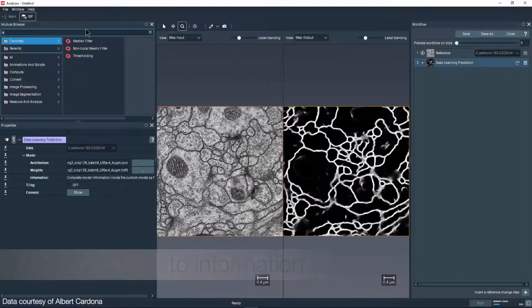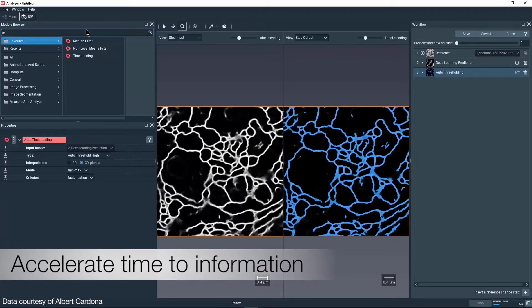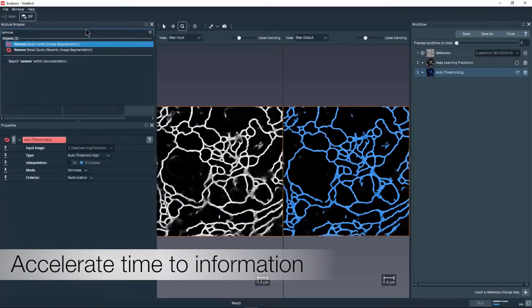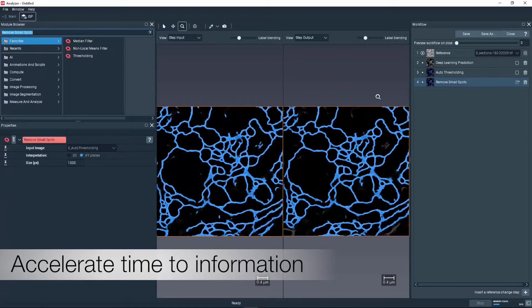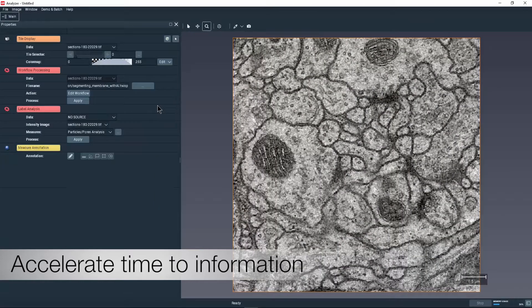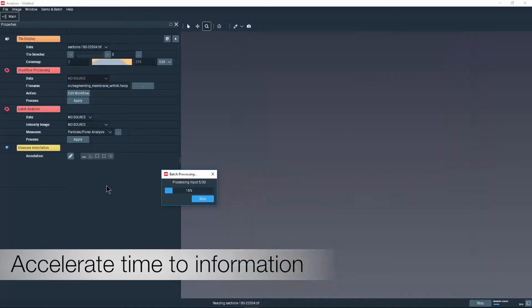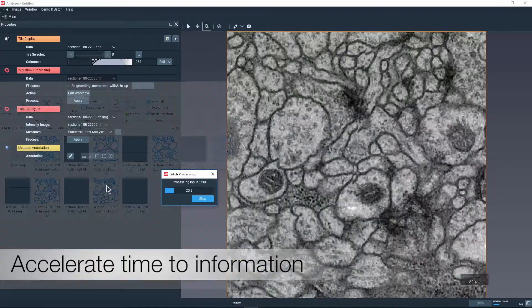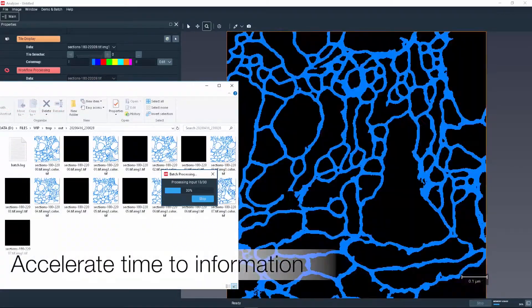The powerful Aviso2D software automation tools allow people to quickly build processing routines for repeated tasks, to benefit from artificial intelligence for automated image analysis that would require the eye of an expert, and to maximize efficiency thanks to batch processing.